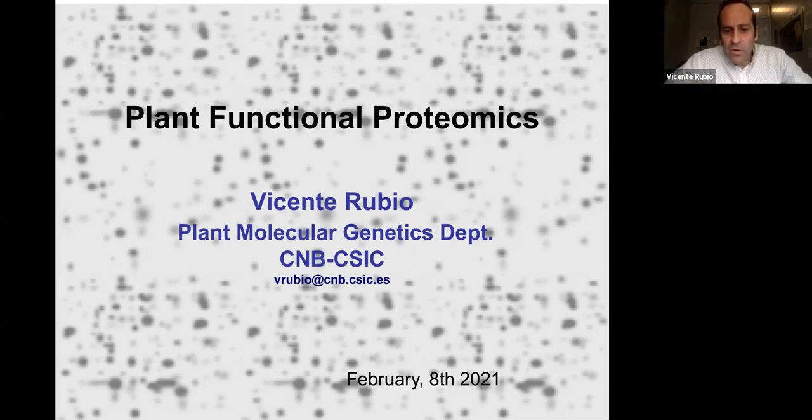Okay, and just also to introduce my colleague Monica. After lunch, she will show you how we handle the MS data we obtain from our proteomics facility, to filter and to discriminate or select those proteins that are really significant, and how to categorize and organize them, and identify those that are really interesting for our research or that can open new avenues of research in our lab.